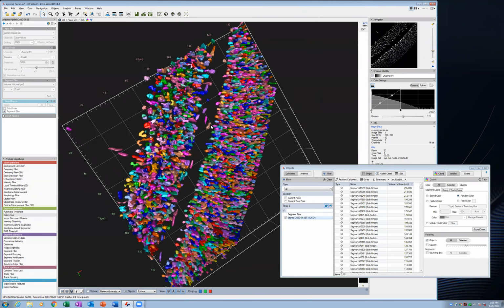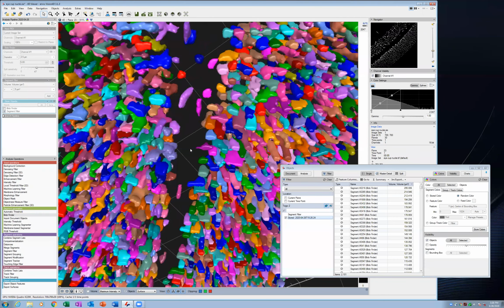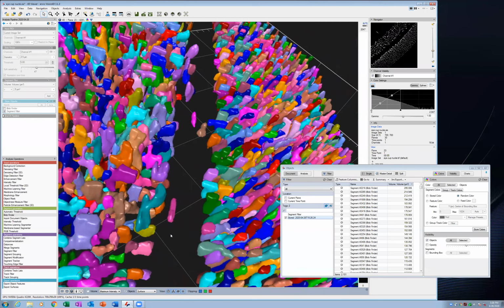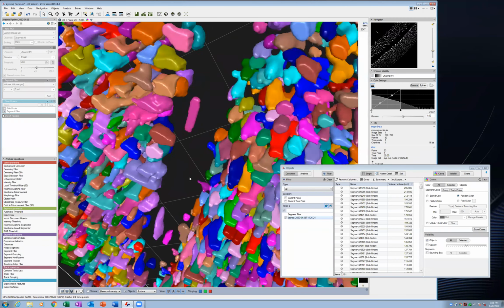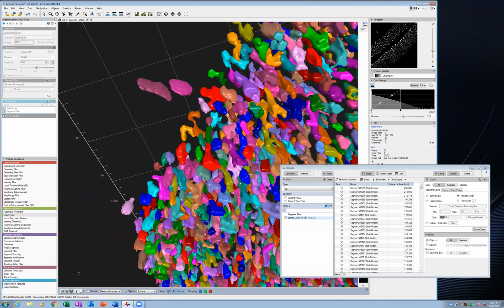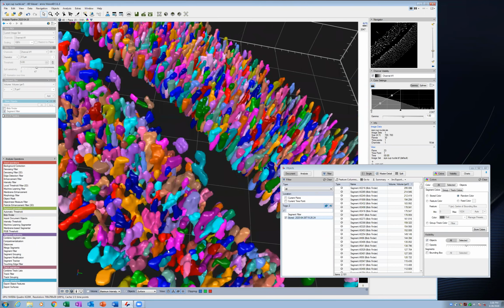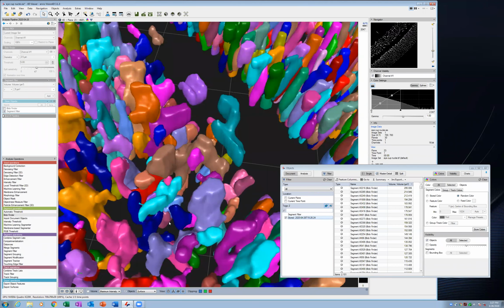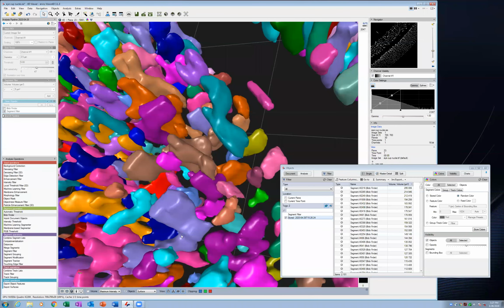So the only thing that's easy to tell is these nuclei that are kind of sitting on their own in between the two layers. So these ones you can tell, it looks like it's done a pretty good job here. It hasn't segmented them into multiple nuclei. They're all staying as single objects, which is good. But if we were to start looking in the inside here, I'm sure we'd be able to find a whole bunch of errors. This one right here should probably be 2, one there and one over here, maybe even 3, one up here and one down here.